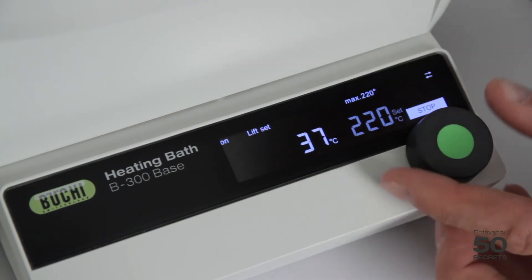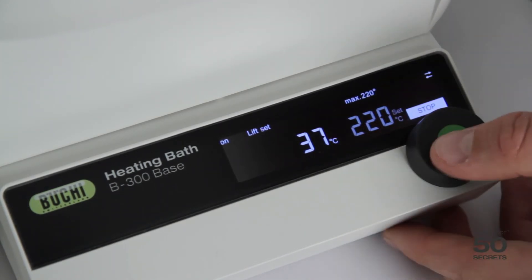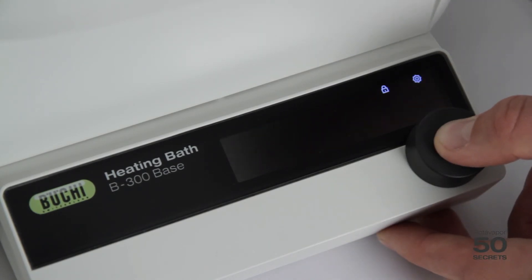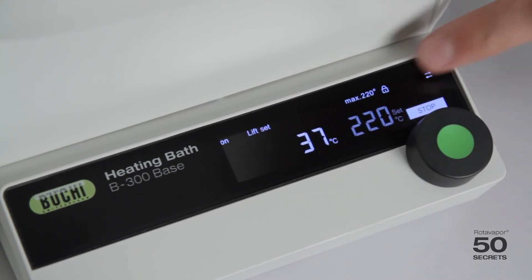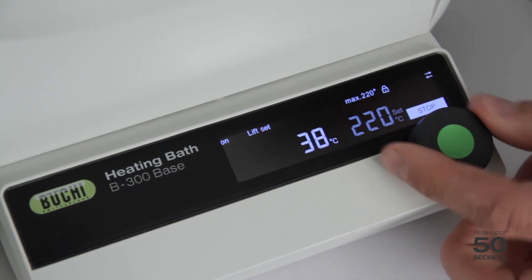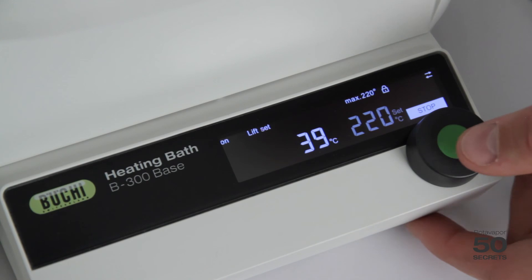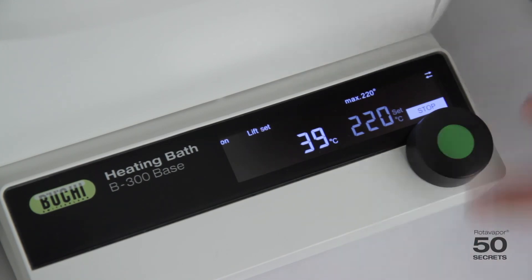If I would like to make sure no one can change the temperature by accident, I just do a long press. I can see the little lock icon, and I press again — now the temperature is locked and I cannot move it left or right. To unlock, I simply press it again and the lock disappears.